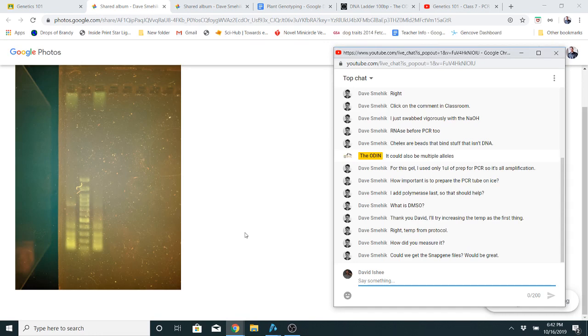From then on, you've contaminated those primers, and those primers now have DNA in them from the template on that run. Any subsequent reactions that you do with those primers will have that DNA added as well. So make sure that you haven't accidentally contaminated either your polymerase or your primers, and the easiest way to do that is a negative control, so run it without template.